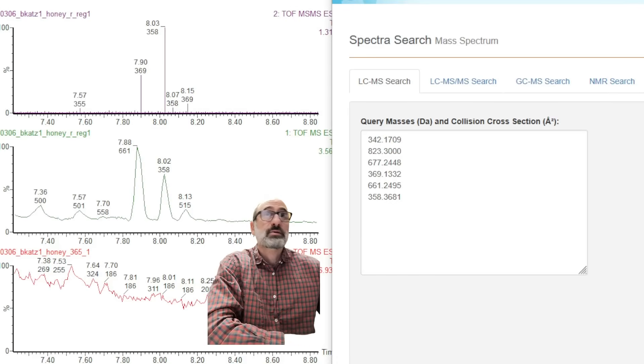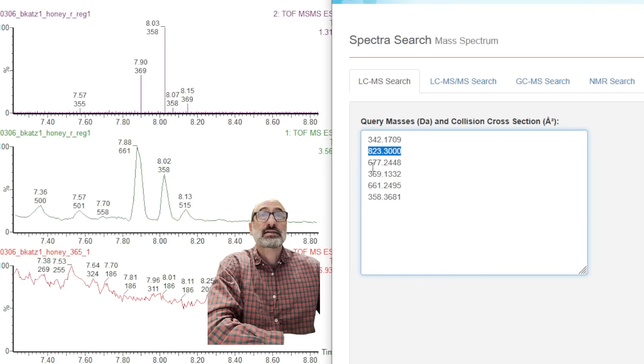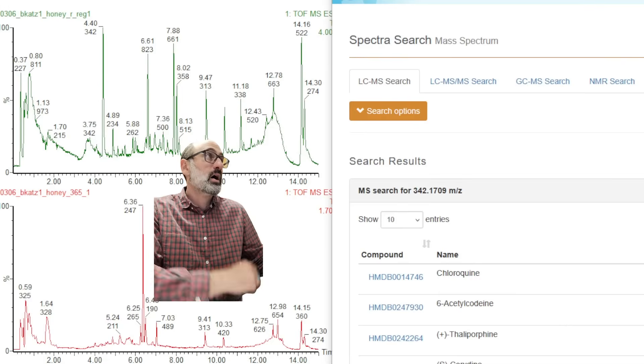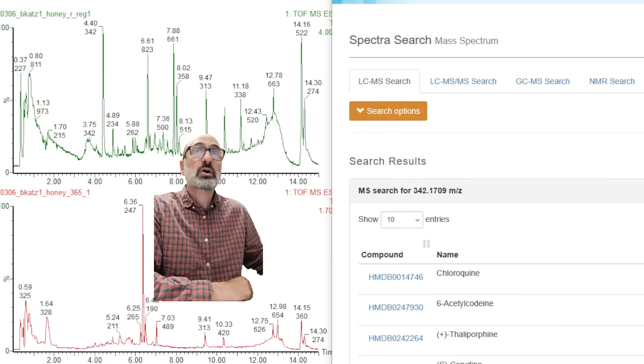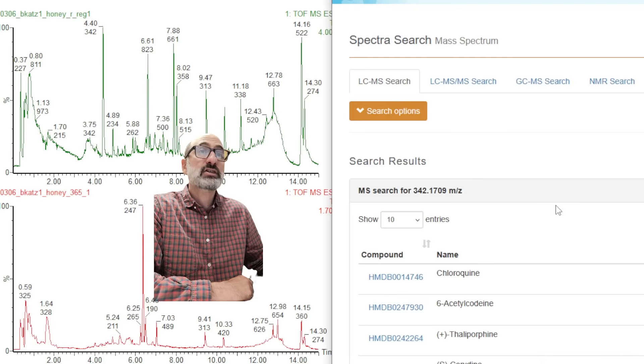All right. So here are the HMDB masses I'm going to search. We have the 342 mass. We have this 823 mass, this 677 mass. All right. Here we go. HMDB results. So again, we got the 342 is the first major adulteration peak in this royal honey.